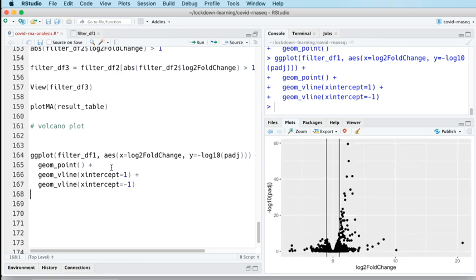They're going to be relatively close together, and also drawing it in black is not particularly great. I'm going to improve the styling of this as we go. Okay, so that's our fold change cutoffs. Everything that lies to the left and right of those two lines hits our fold change cutoffs, so we consider it to be differentially expressed by that threshold.